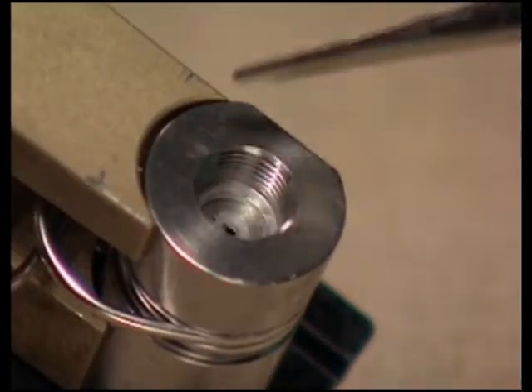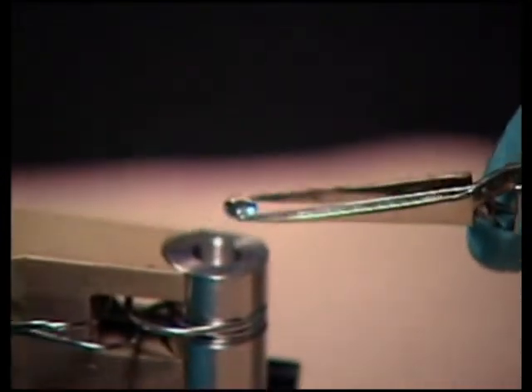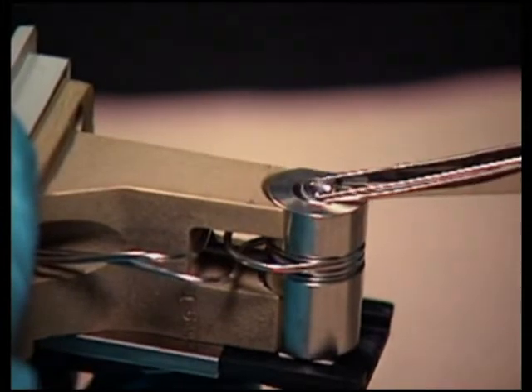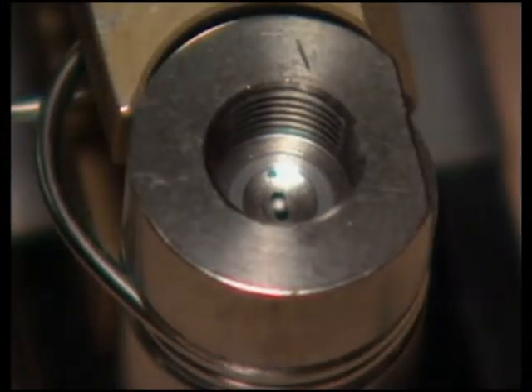Inspect the entrance lens and use nitrogen to blow any dust off if necessary. Using tweezers, drop the entrance lens into the flow cell body with its curved side facing up. Make sure the outside diameter of the lens lies inside the counter bore of the flow cell body.